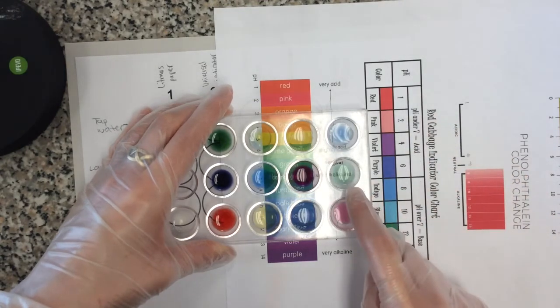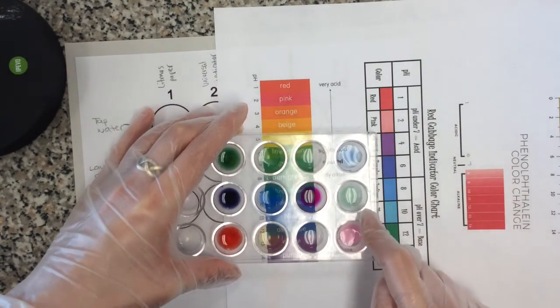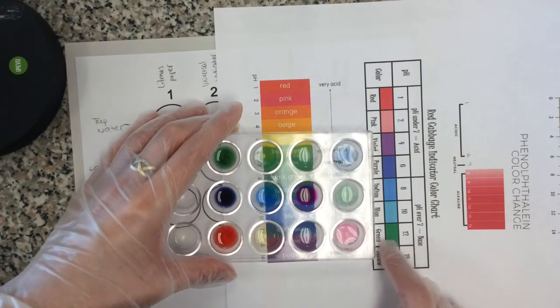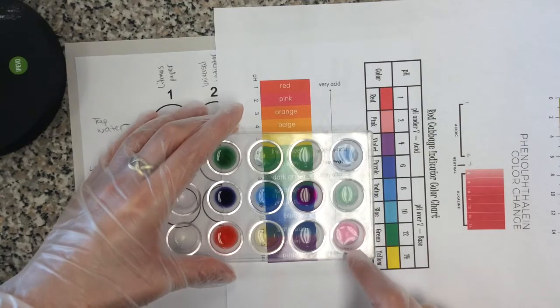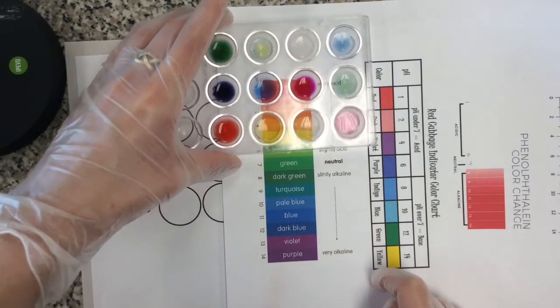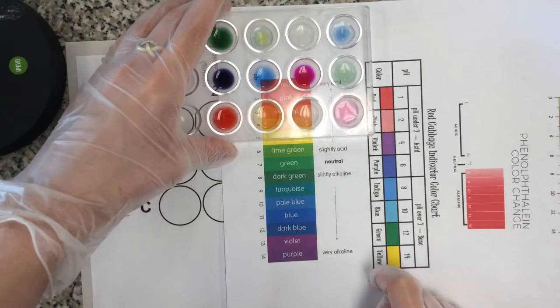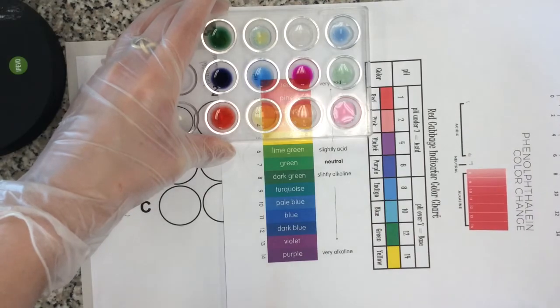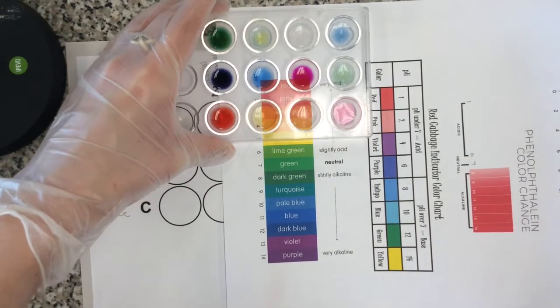Next one, it's kind of a green color, right? So the only green we have is about 12. And my last one, my lemon juice, is that pinky kind of color right here. So it's somewhere between the red and the pink. You tell me what you are observing right now in your chart.